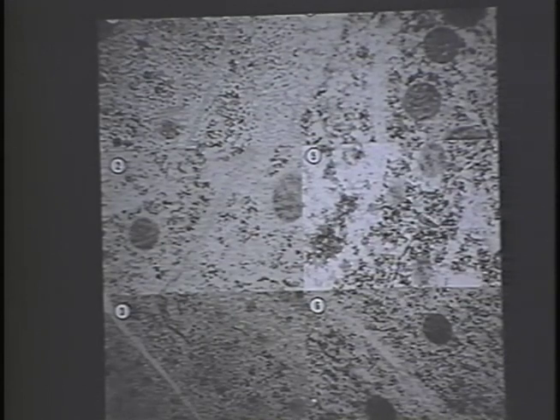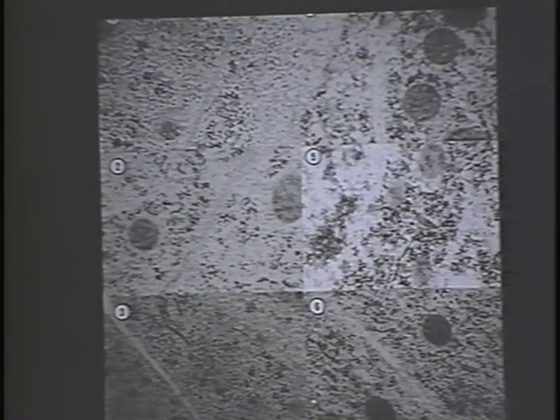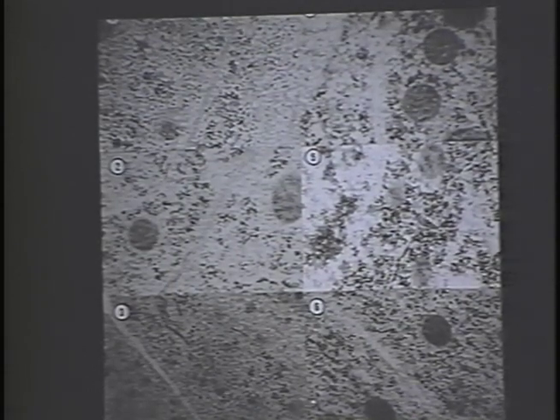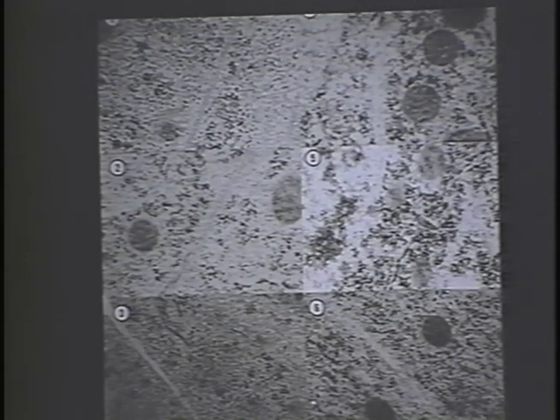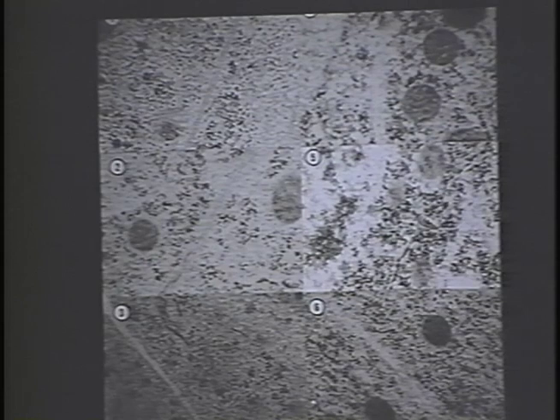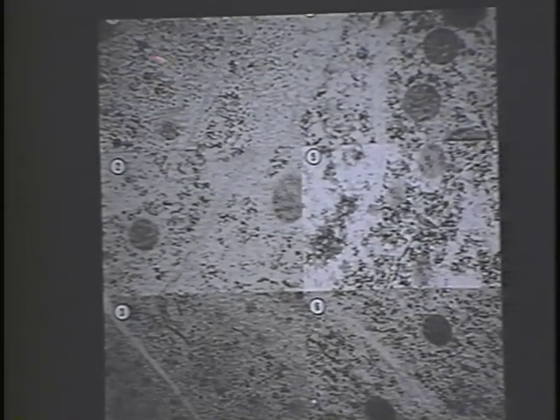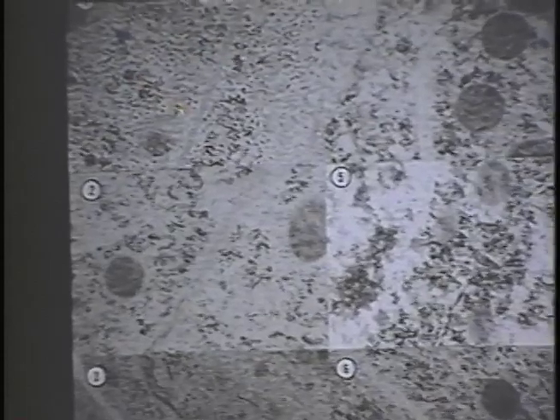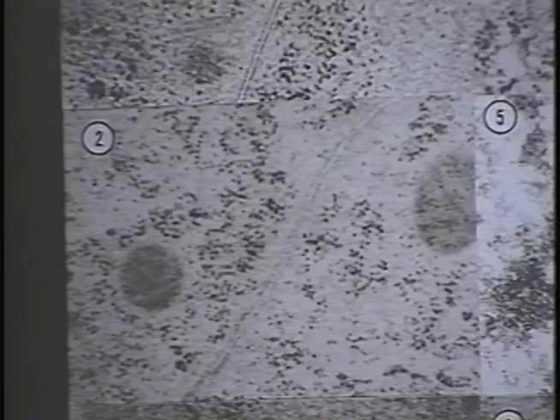Kent McDonald and Mary Morphew of the Boulder High Voltage Lab have looked extensively at different freeze substitution protocols, and this slide illustrates some of their results. They high pressure froze Drosophila embryos and freeze substituted them in a variety of cocktails, including 1% osmium and acetone, 2% glutaraldehyde and acetone, 1% osmium and methanol, or methanol alone.